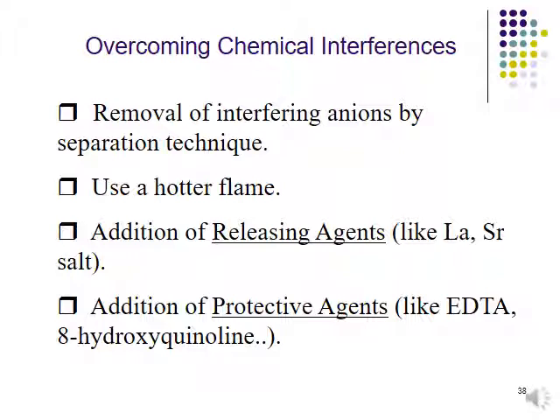Next is the addition of protective agents like EDTA or 8-hydroxyquinoline. These are protective agents, also called masking agents. You can try to use any kind of agent in order to avoid the chemical interference being detected.